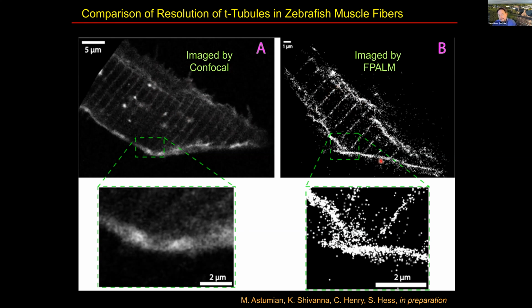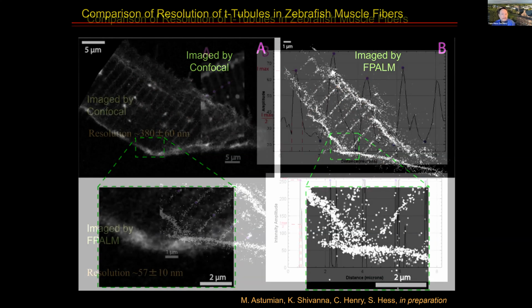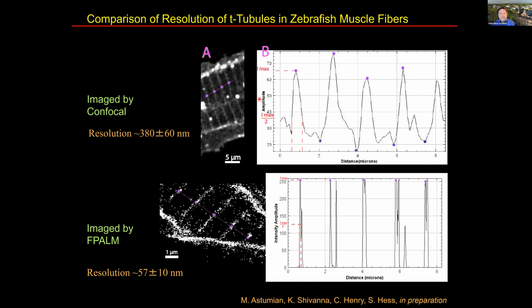them more distinctly. And when we quantify the cross sections of these tubules, in the confocal, they have a width which is about what you'd expect, the diffraction limited resolution of 300 or 400 nanometers. In the super resolution scope, those profiles narrow to 57 or so nanometers, demonstrating that the features are better resolved. And thus, if we need to study those muscle structures and compare disease and non-disease fish, we're able to do that with localization.